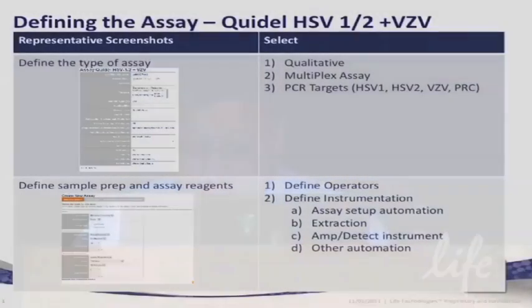In case our interpretations of these guidelines and white papers are incorrect, it can be changed completely by the lab to meet whatever their needs are. And so for this assay, we specifically looked at precision and the method comparison against our in-house HSV assay. Again, we use these samples, so we define these 40 unique samples as well as our controls. So after defining these guidelines, a protocol is generated, and I just took quick screenshots of the protocol.